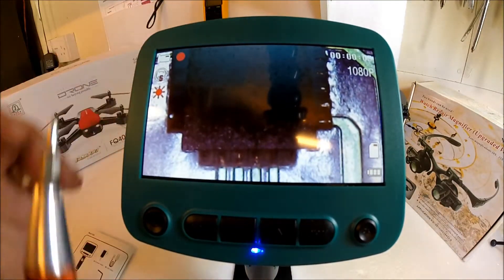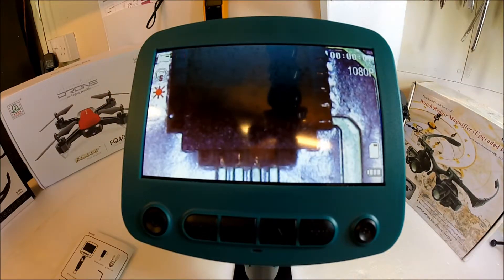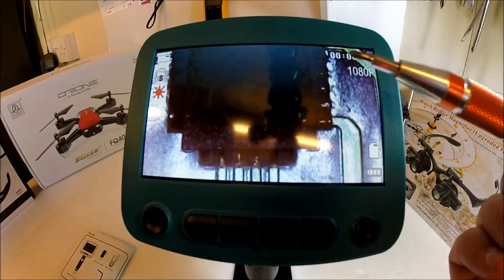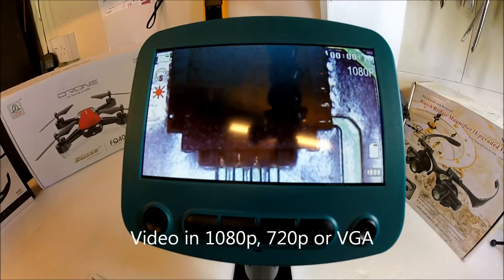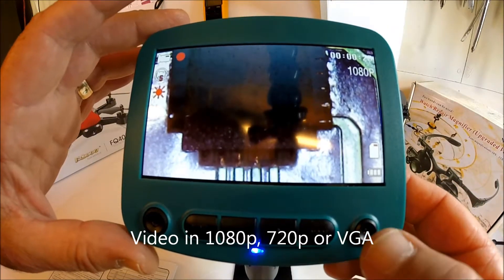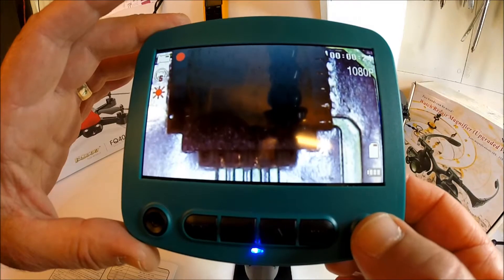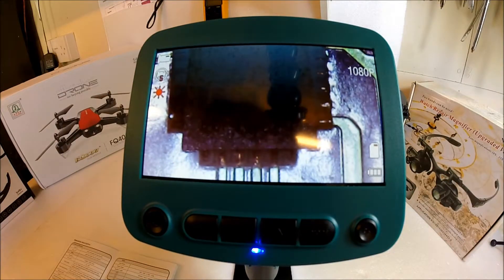You can see there that we have a red LED light flashing, indicating the video is currently under way. You have different settings — you can use 1080p, I believe there's 720p, or VGA. And to stop the video, you press the OK button once again. All that is now saved to the microSD card.